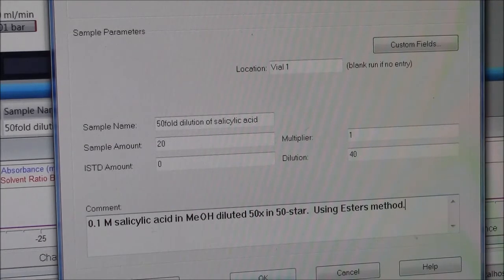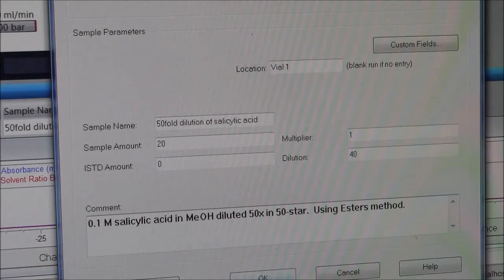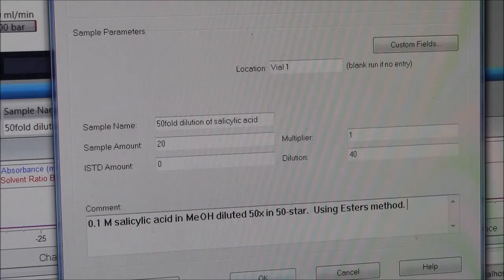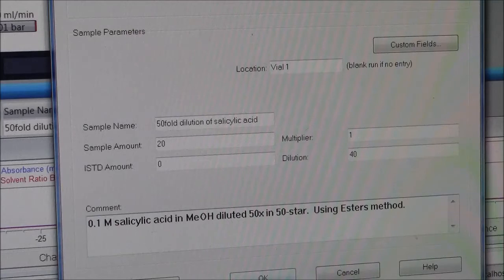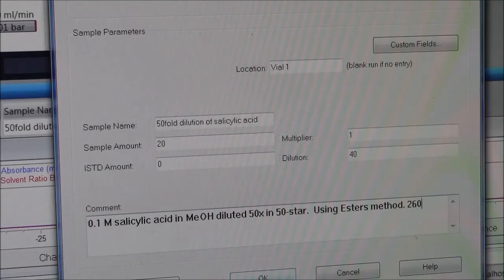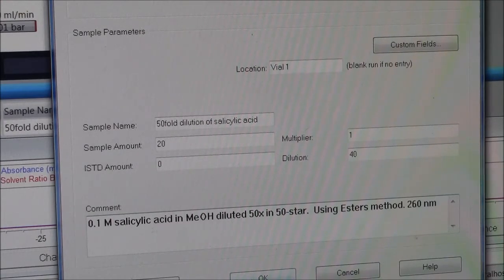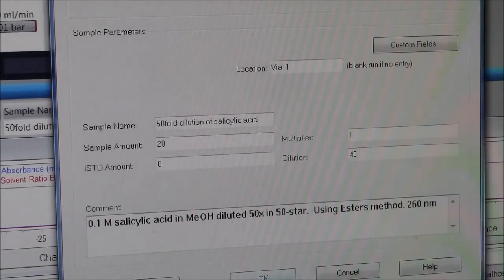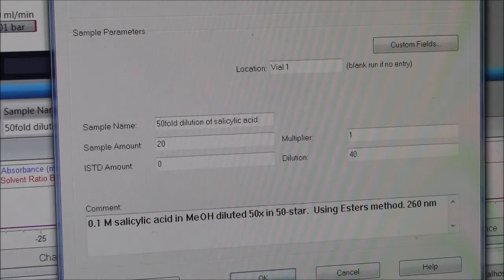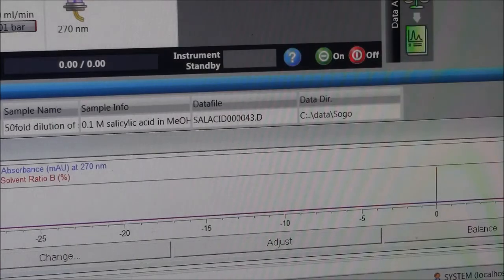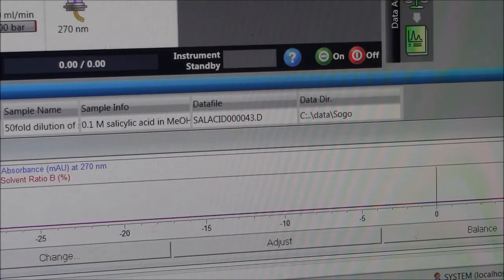I should also say what wavelength I'm using on the wavelength detector, so that can help me also. So I think we'll use 260 nanometers. Okay. All right, so that's good detail there, and I clicked OK.